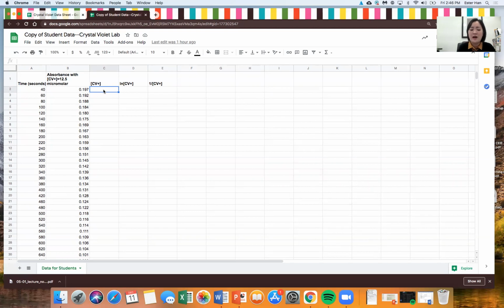And remember what the x actually stands for here. The x is your concentration of crystal violet, okay? And the y is the absorbance, right? So remember the whole purpose of doing those 6 different solutions that you got last time was so that you could get an equation in which you could figure out the concentration of crystal violet as the time was passing in the actual reaction.